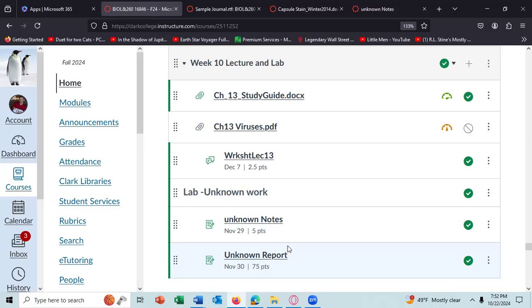The gelatin hydrolysis test takes one week, and that's why you'll get the results on Tuesday. And then the Gram stain, you're going to start it on Sunday, but you're not going to look at the results until Tuesday. And then the PR lactose test takes a day to incubate. So that's why we're starting on a Monday, and you'll get the results on Tuesday. Any question about any of that?